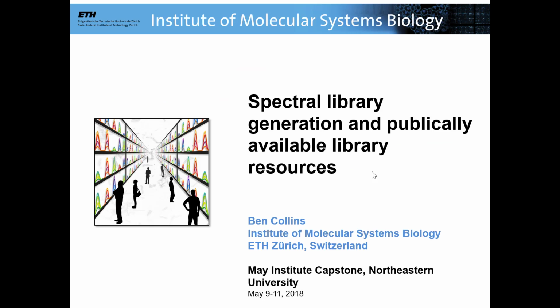I'm going to quickly go through part 2, spectral library generation and public library resources. I just want to mention some details of this, and we'll try to get through maybe the first third of it and cover some more of it tomorrow.